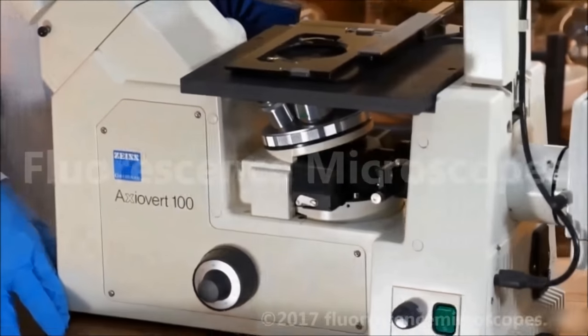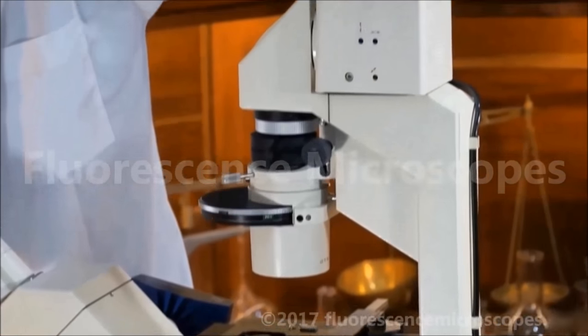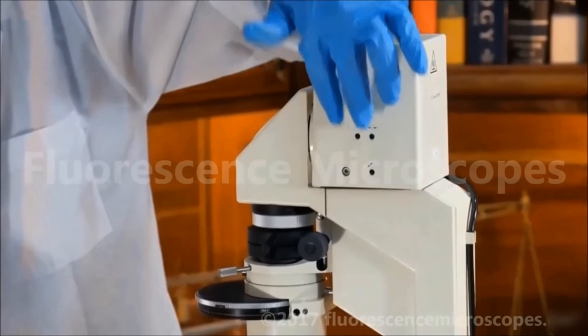The halogen also has some centering knobs. You can insert a 3-millimeter hex and adjust the centering screws.